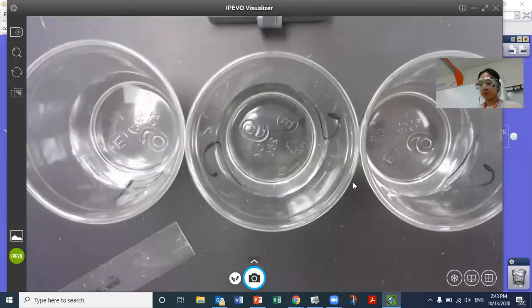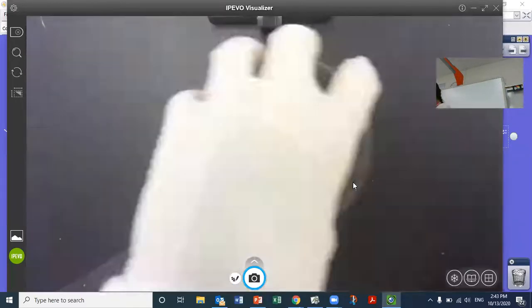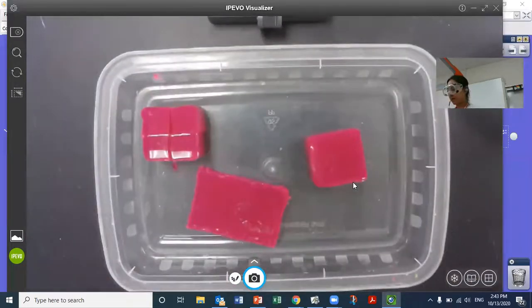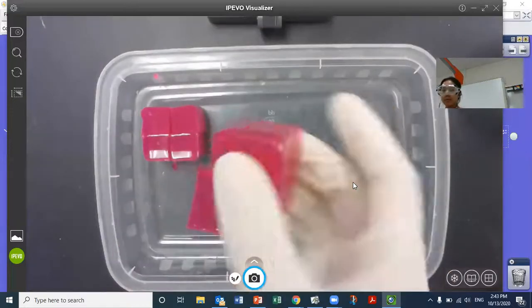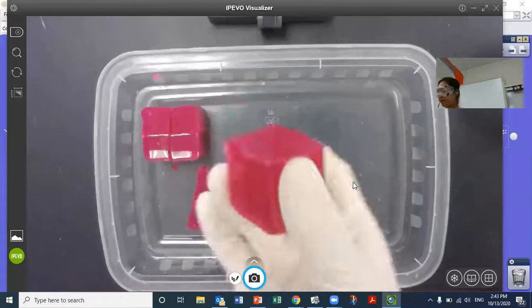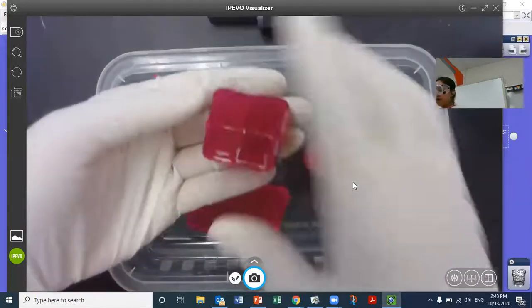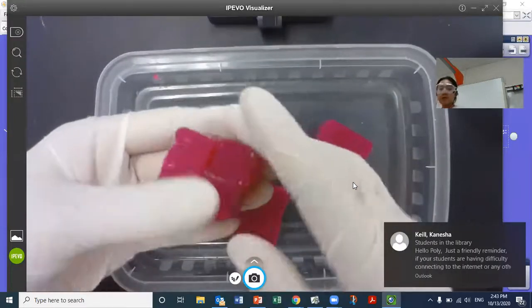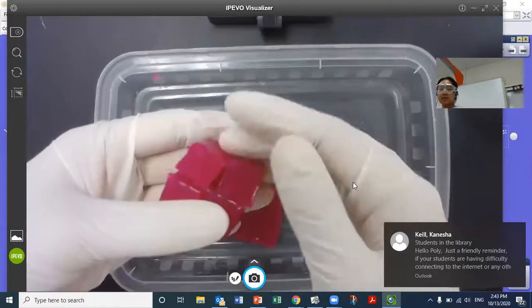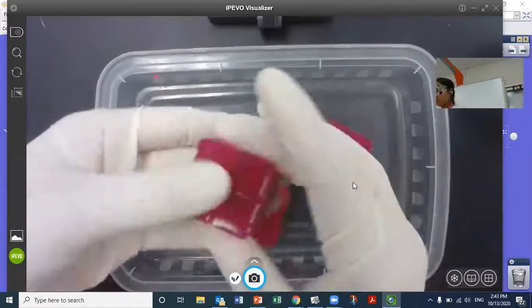those are the 3 cups that I already set up with acid inside of them, but we don't need those right this second. So we're actually going to be looking at our cubes first of all, and I've already cut them out for you. So we have our big cube, right? It's 1 big cube, 1 big cell. Now over here we have 4 small cubes cut from the exact same mold that the original big cube came from, but we cut it into 4 separate little pieces that are as closely similar to size as possible.